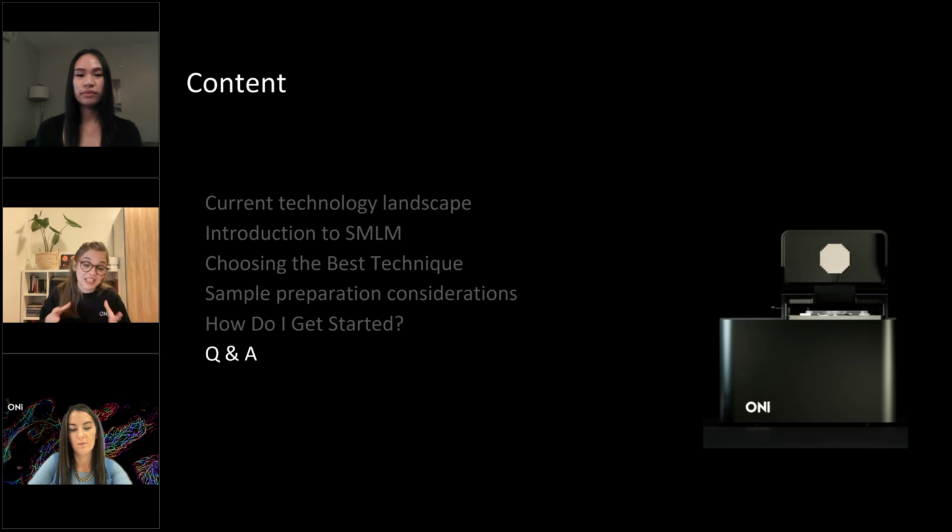So if you have an EV, we have a special protocol to attach them to the surface with capture molecules, but the same if you would have an EV from a plant or a bacteria source, you would have a special surface treatment to capture your structure of interest. The same for bacteria and virus plants. I know some people are really interested in imaging live bacteria.